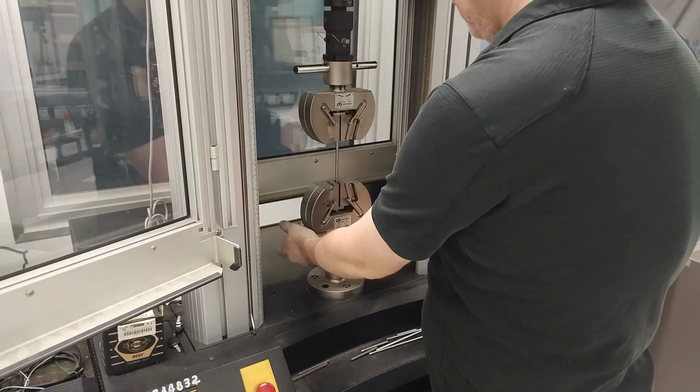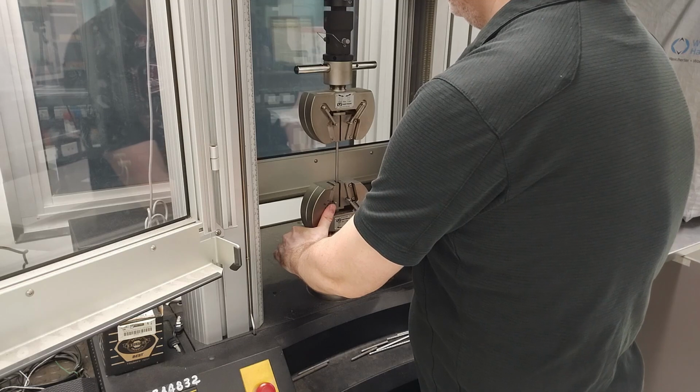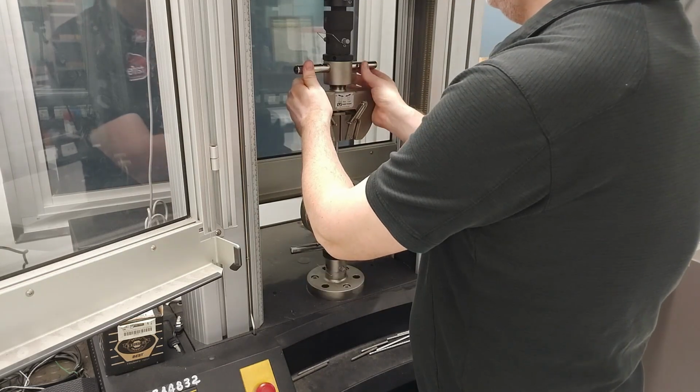Once the wedge grips are firmly tightened, I will close the safety door and begin the tensile test.